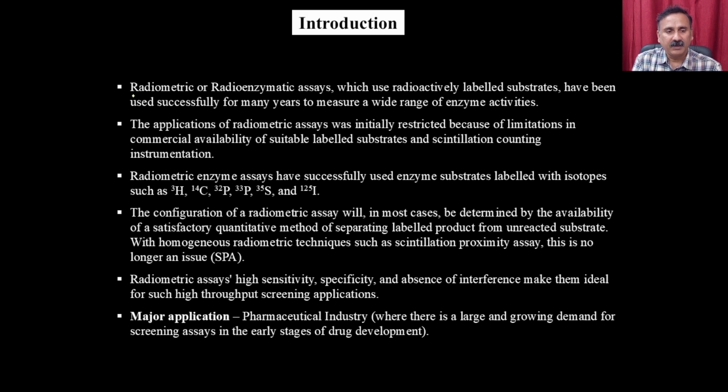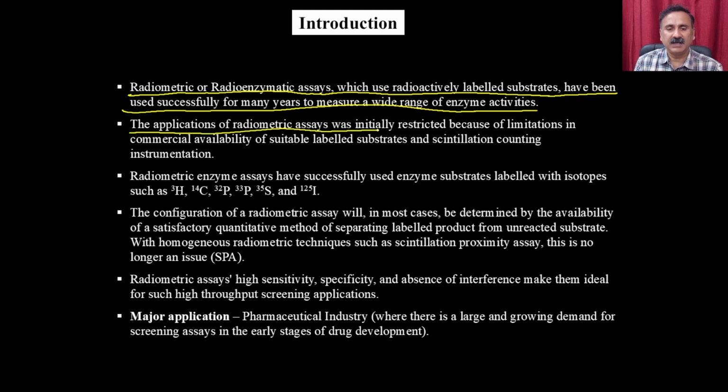The radiometric or radioactive enzyme assays, which use a radioactivity-labeled substrate, have been used successfully for many years to measure a wide variety of enzyme activities. The application of radiometric assays was initially restricted because of the limited commercial availability of suitable labeled substrates and scintillation counting instruments.